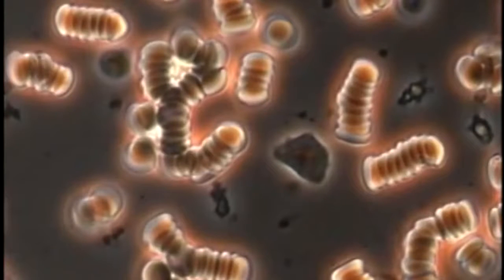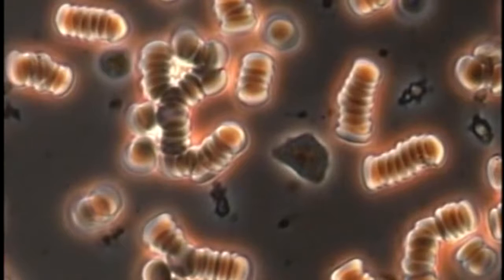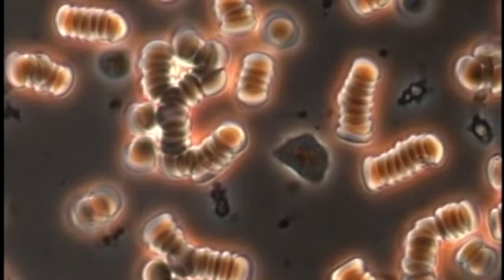This is the blood of one of my patients right at the time when he came to see me at the clinic. It looks like there's stacks of coins piled against each other. Those are red blood cells. They're not supposed to be like that.